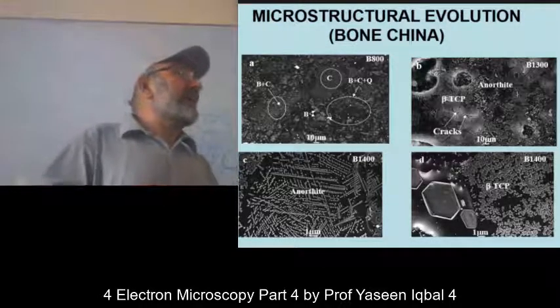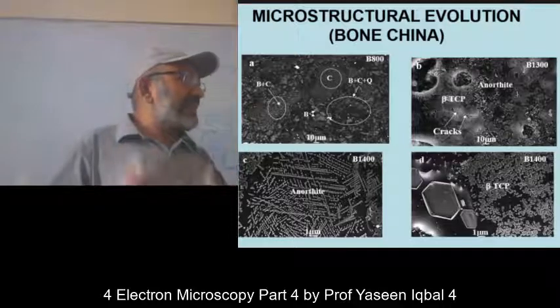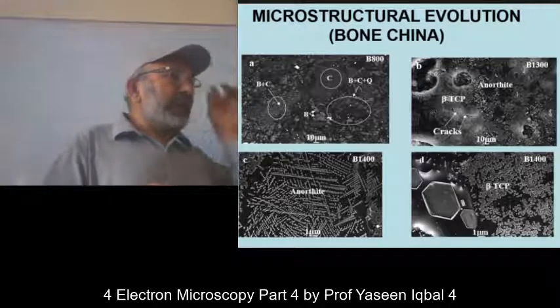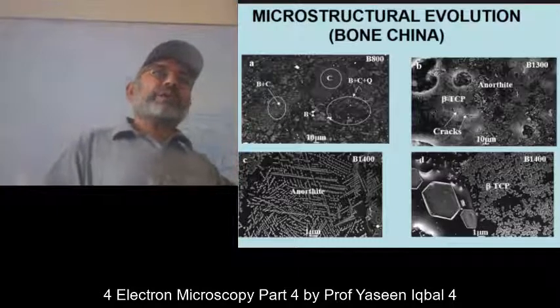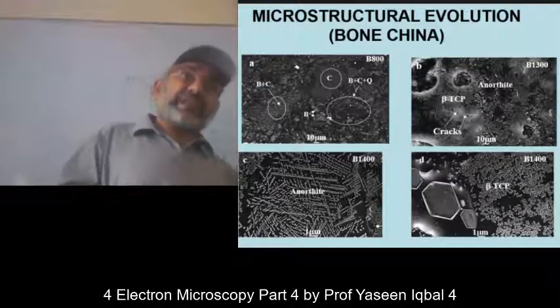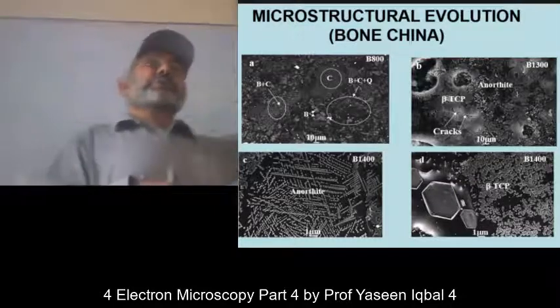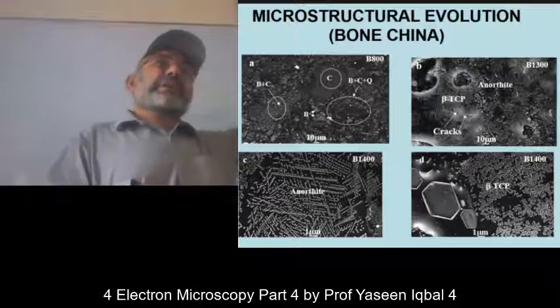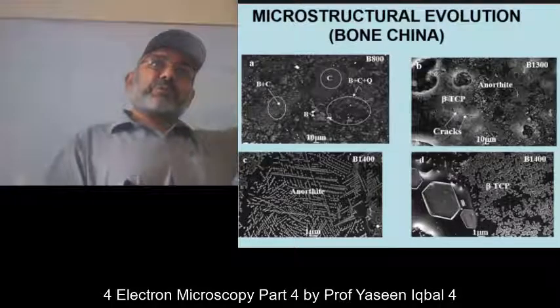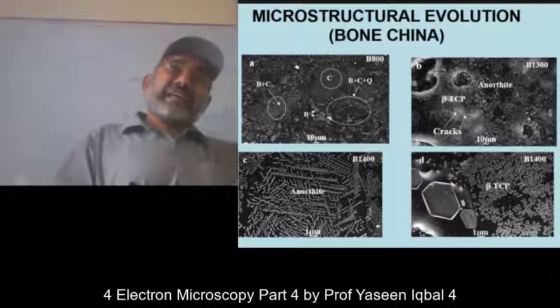So that is why the selection, the very minute fine selectivity of the electron microscope is its main drawback. And for that reason, whatever you get with the electron microscope, you check it with the scanning electron microscope. We check it with X-ray.